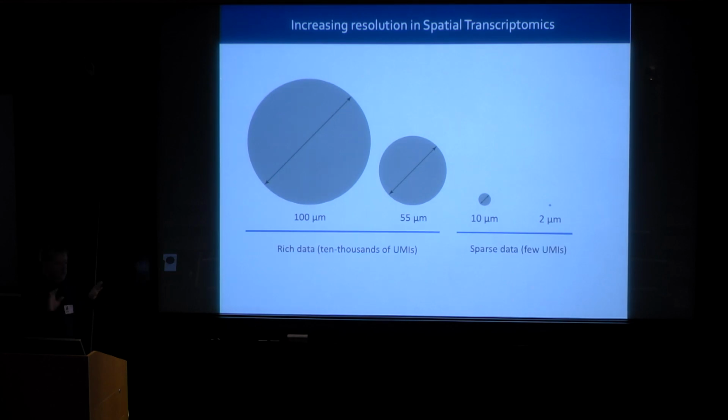So we have these scenarios, with very small beads or the spotted arrays. But what's clear from our experiments, obviously these are only pilot experiments in a way, is that the sensitivity is not really there for the things that we really like to do, which is data-driven analysis. So we are very fond of these other arrays, which have 10,000s of UMIs per measurement over a tissue space.